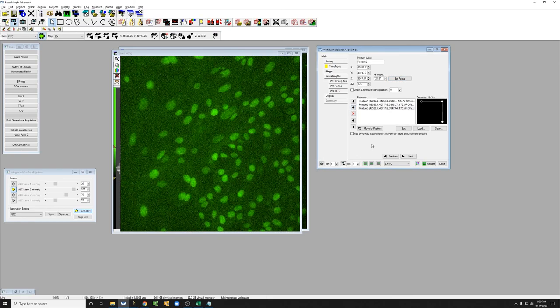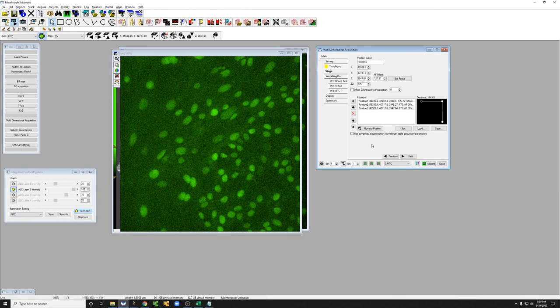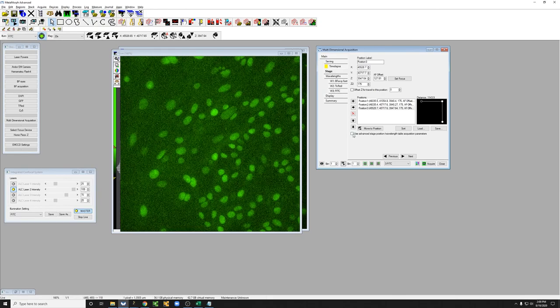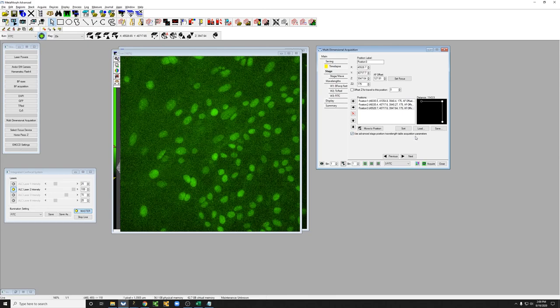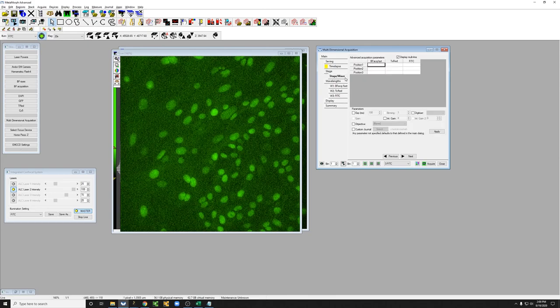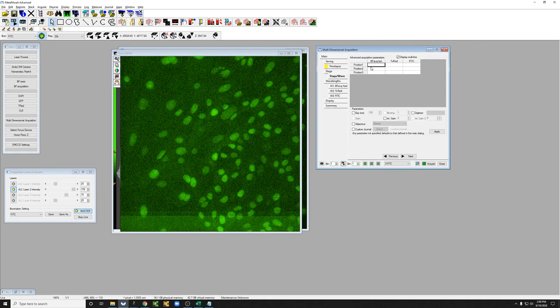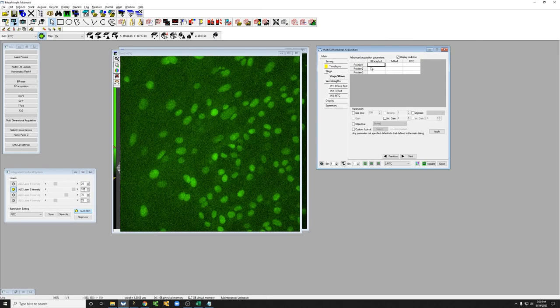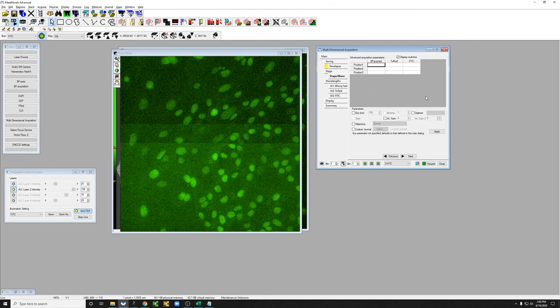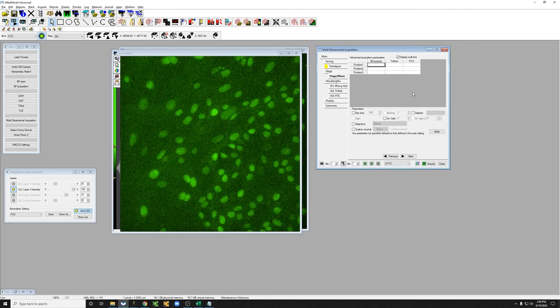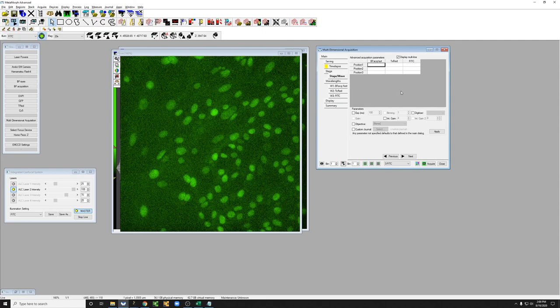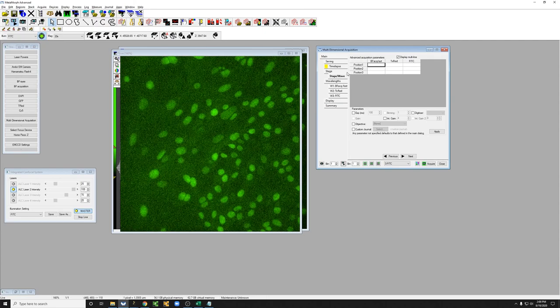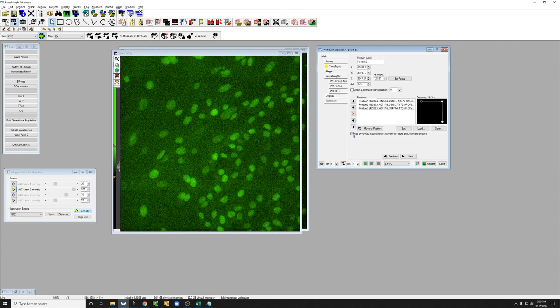Now, if you're in a situation where you only want to acquire certain wavelengths in certain positions, you can click here on advanced stage position wavelength table acquisition parameters, and you can say which wavelengths you want to acquire at which positions. I'm not going to go into details on that. I just want to show you that that's possible. Let me know if you're interested, and we can discuss how to use that for your particular experiment.